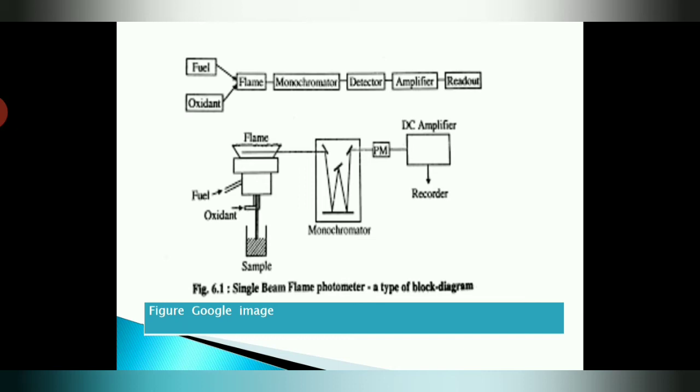The burners. Which type of burner is useful for the generation of the flame? Here we are using two types of burners in the analytical flame. First is the open burner, that is nothing but the Bunsen burner. But nowadays this type of burner is hardly used because it has easy flame flashback. Therefore we are using the Meker burner.